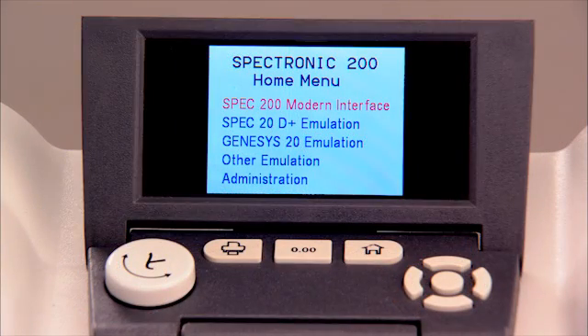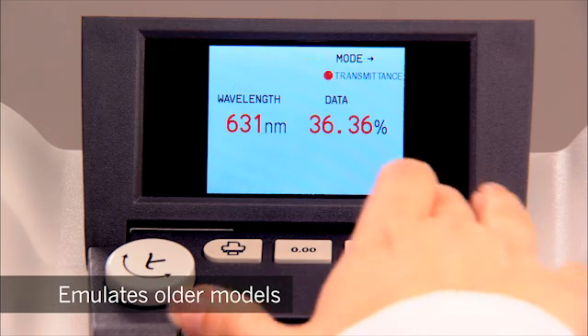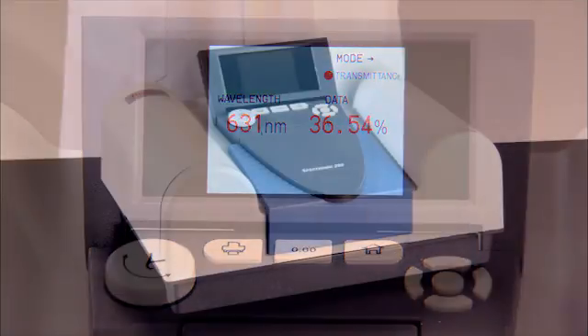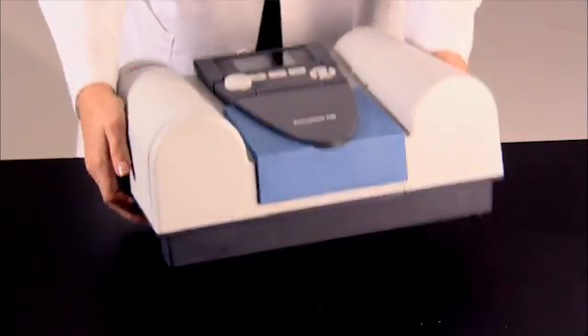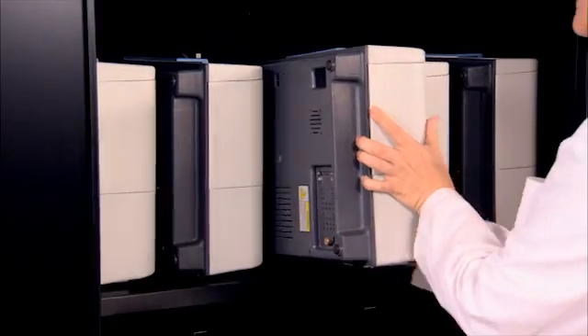Or, if the SPEC 200 shares a lab with older spectrophotometers, it can emulate them so that your students can use the same protocols, no matter which instrument they're working with. The Thermo Scientific Spectronic 200 — with the experience gained from over a half million SPEC 20 customers, the SPEC 200 will become the new standard of the 21st century teaching lab.